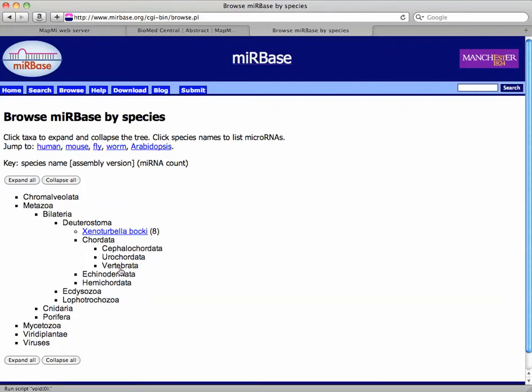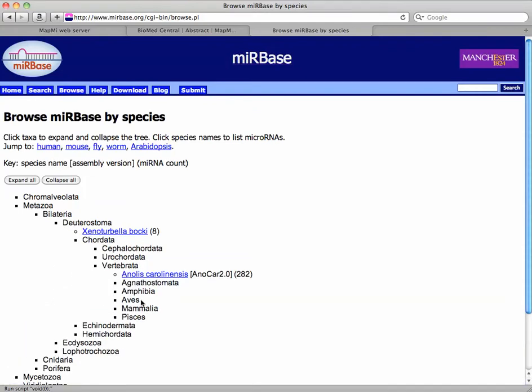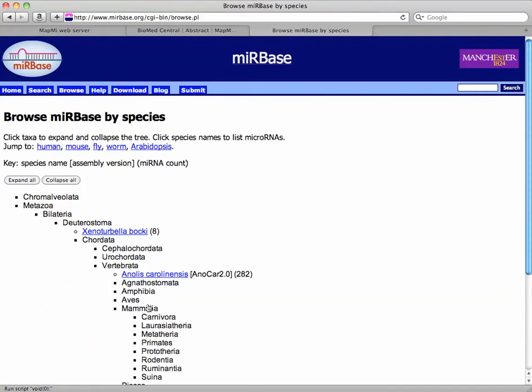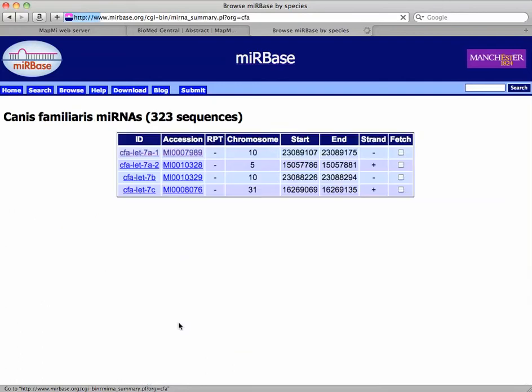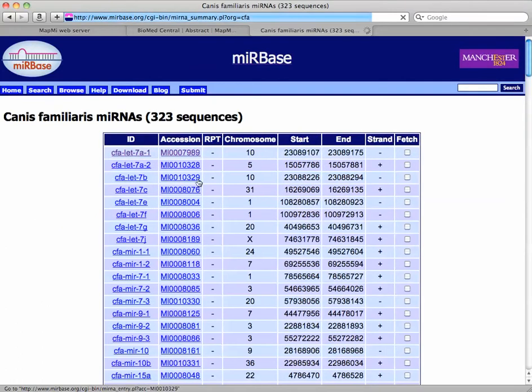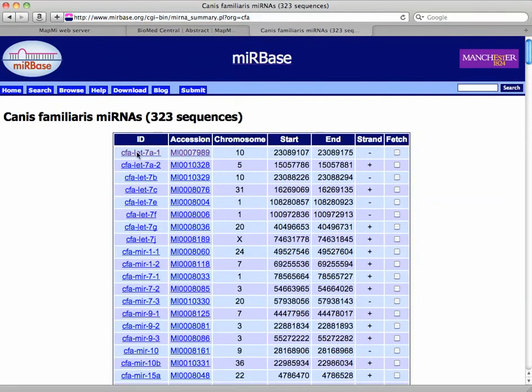And there we are. So now we can get a list of dog microRNAs. I'm just going to look at this first one.